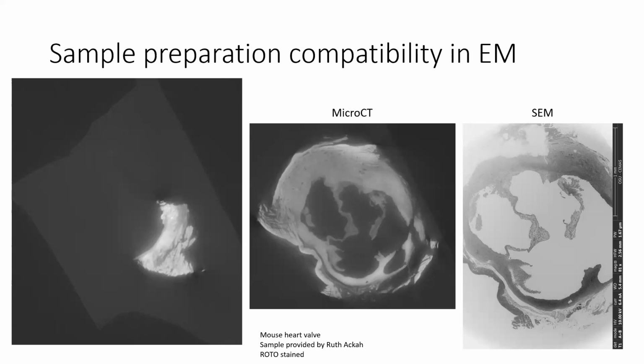So after you collect the data, how long did it take to analyze the data and then also prep? So I would argue that analyzing the data is what we're doing right now. So let's factor in this time. Creating that took about 3 minutes. I dropped the TIFF stack into ImageJ and I flew through it and saved it as a .avi. And that was it. So it was one of the most user-friendly machines I've encountered. It's wonderful. If you want something for the cover of Nature, that takes a little long. Yeah, you have to color it.